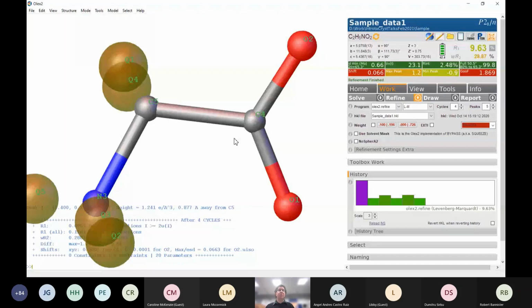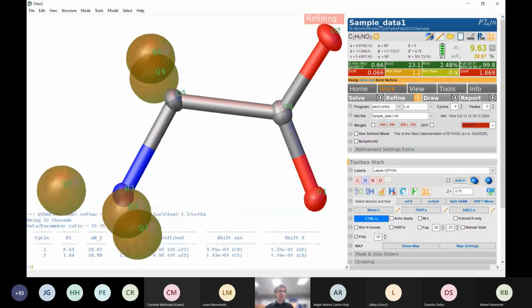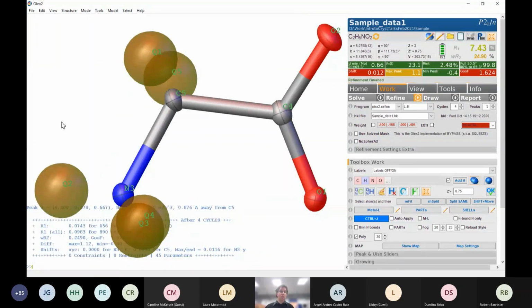This is a better approximation of your setup, whether you've got vibrations or just movement in the structure, such as the long bonds. Now, where you find that is in the toolbox. There's a button here that looks like an ellipsoid, also like a rugby ball, and next to it there's something that looks like a sphere. So again, we will try and refine it. Let's go forward, see what happens.